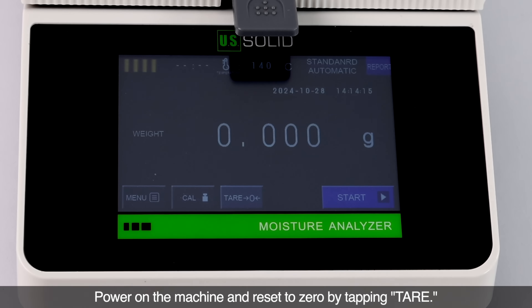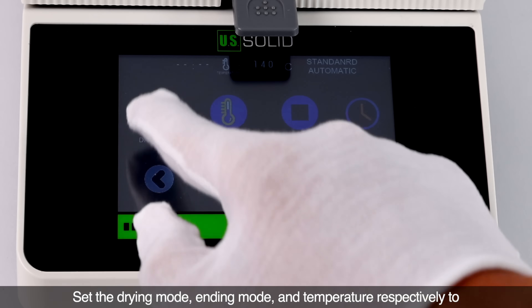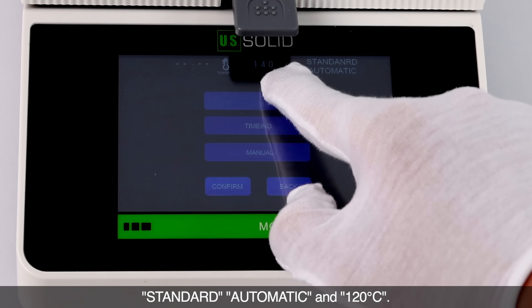Power on the machine and reset to zero by tapping tare. Set the drying mode, ending mode, and temperature respectively to standard, automatic, and 120 degrees centigrade.